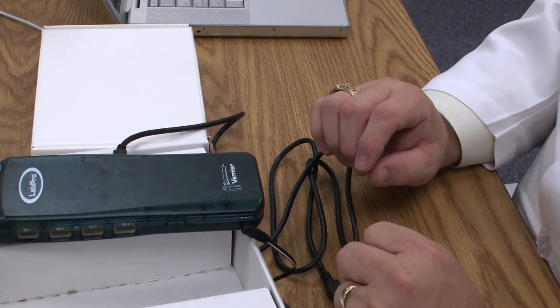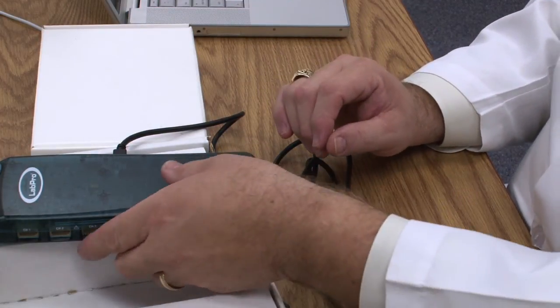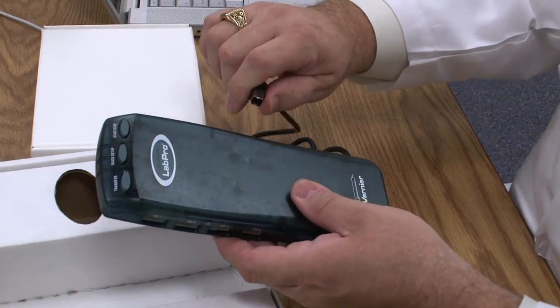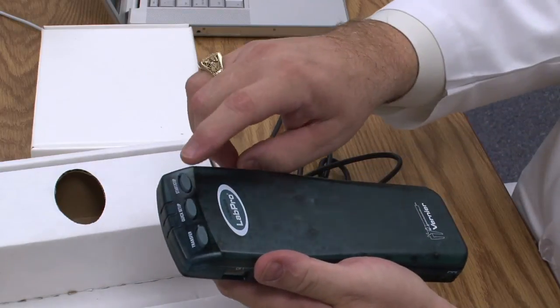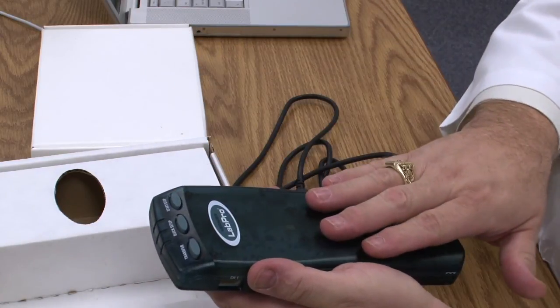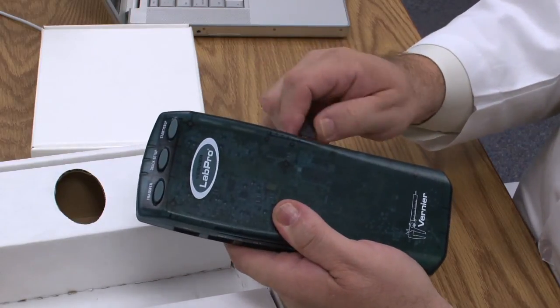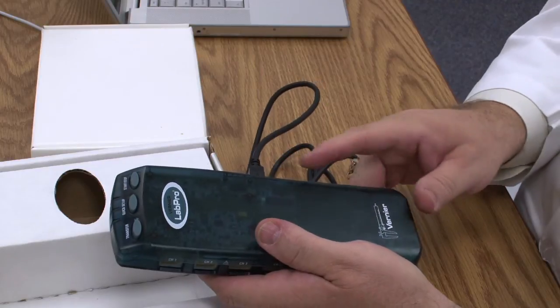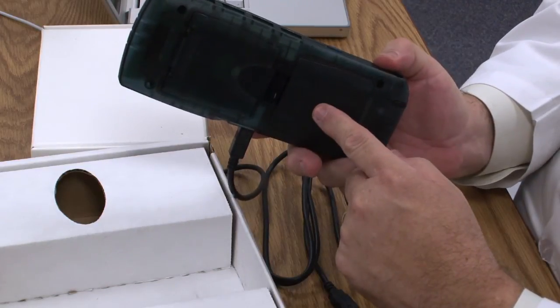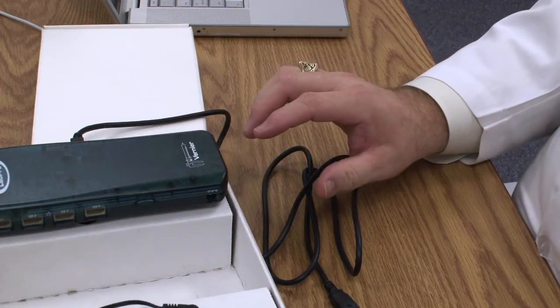There are situations where you might want to collect data not connected to the computer. The LabPro is designed to allow you to disconnect it from the computer, take it into another environment, hit the start-stop button, collect data, come back into your lab, reconnect the computer, and download the data. In that case you'll need a set of batteries, but for most of what we're going to use this for, the power adapter is what we want to use.